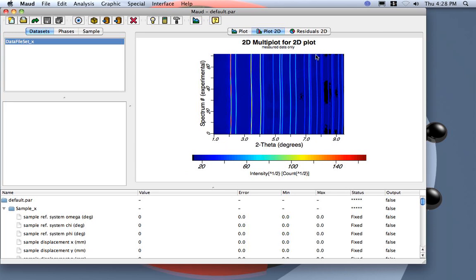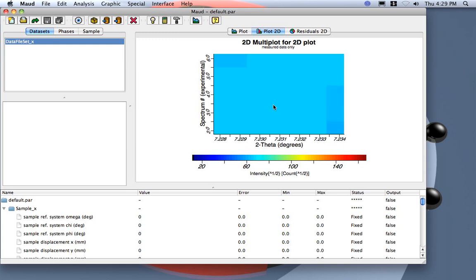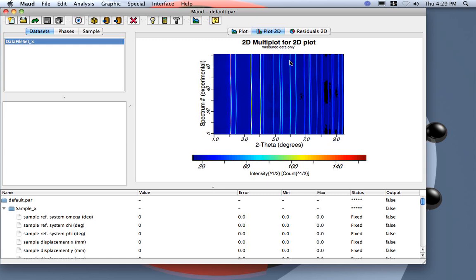Now plot 2D. You can see we didn't set the correct center. If we click and drag, you can see we get this wave pattern, and this is due to the fact that we do not have the correct center.